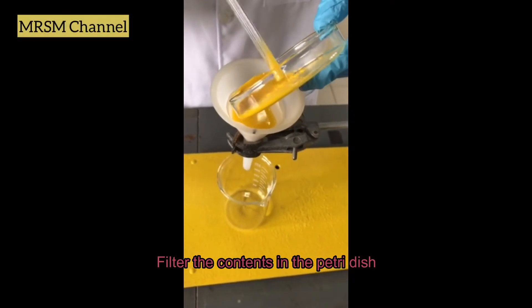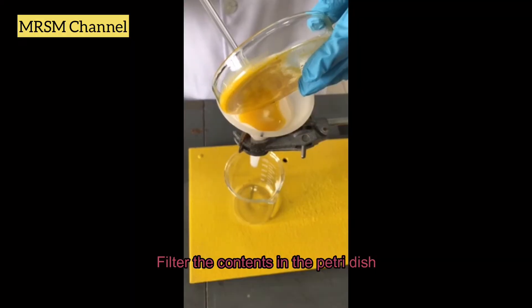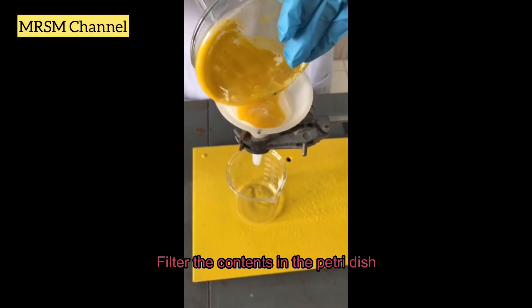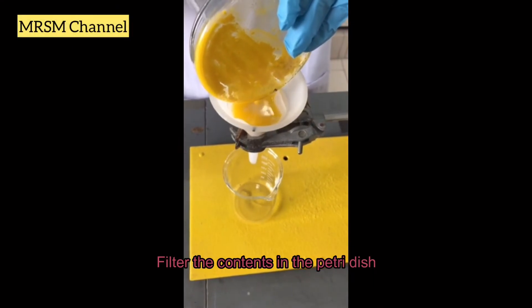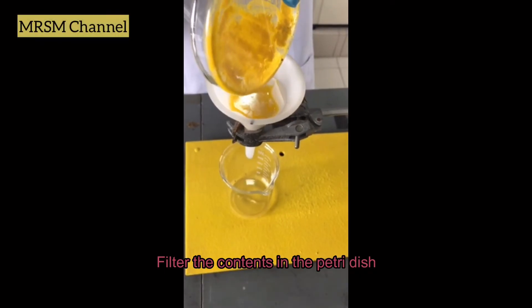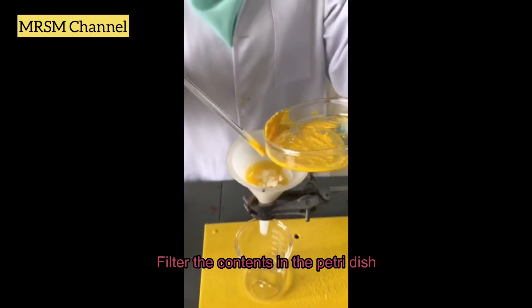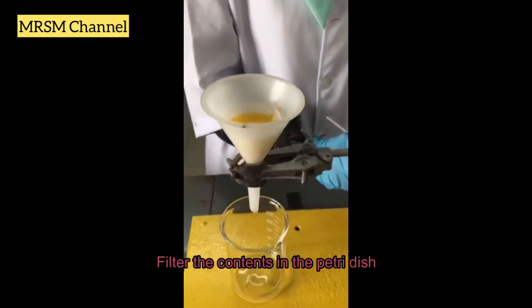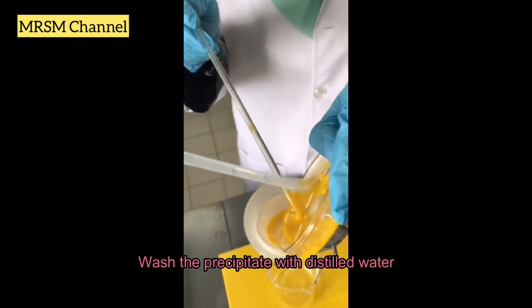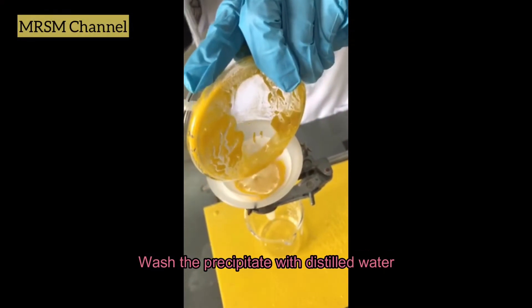Make sure all the precipitate from the petri dish is transferred into the filter funnel carefully. Then rinse the precipitate with distilled water to make sure all of the precipitate is collected in the filter paper.